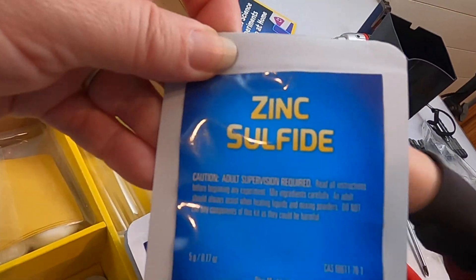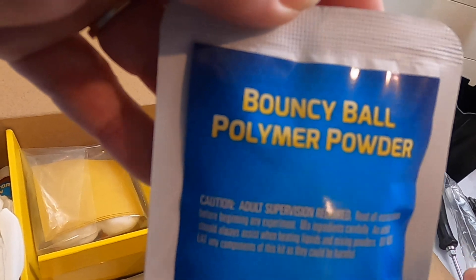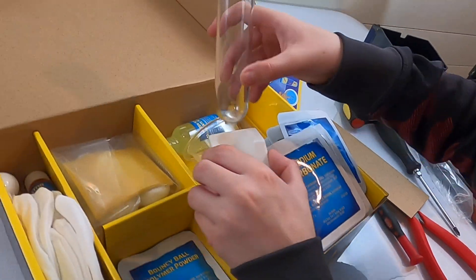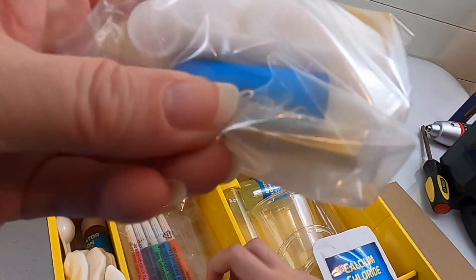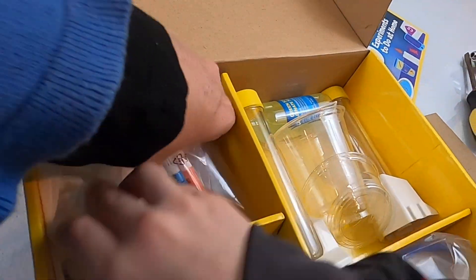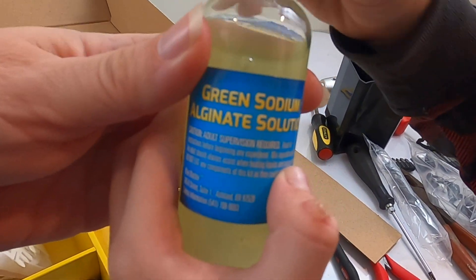Zinc sulfide. There's others — you didn't go over them all. Bouncy ball polymer powder — this one's going to be useful. I'm smelling something like chlorine or something. Cotton balls and some other things in here? Gloves? Green sodium alginate solution. Alginate.